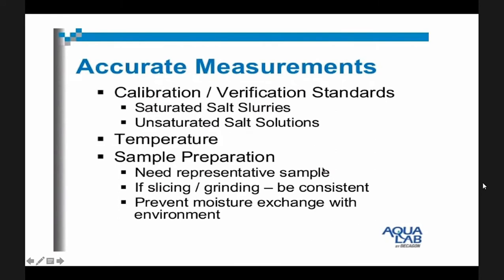Okay, so this is also very necessary. Like for example, if you take a sample from one sack of flour or from one warehouse of flour, your sample for the determination of water activity should be representative of that bulk, or volumes. So how do you gather the sample to be representative? This will be discussed in sampling and sample prep.